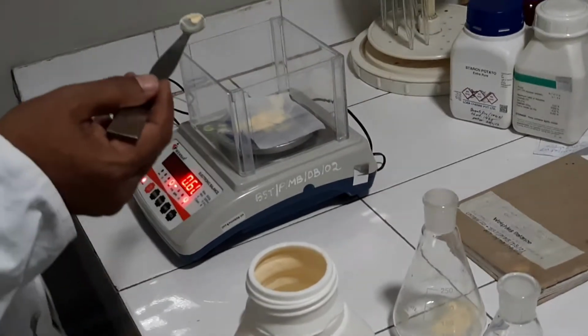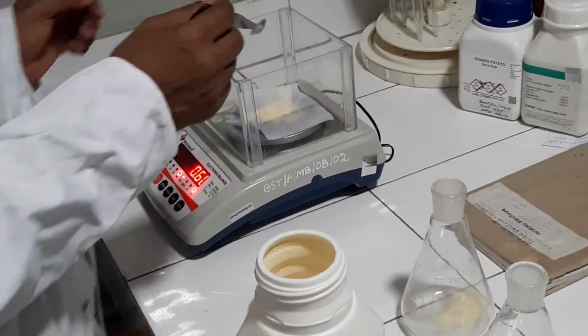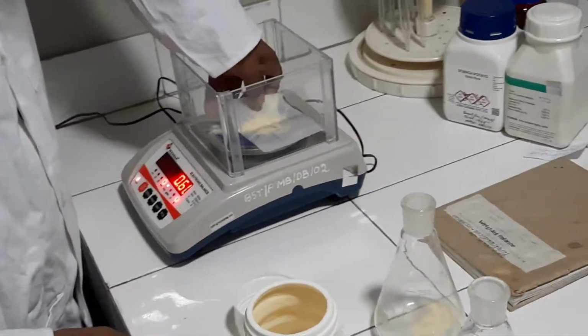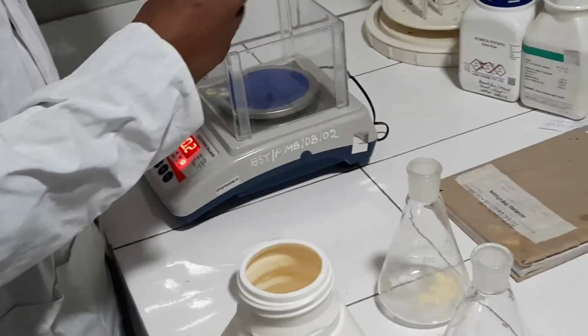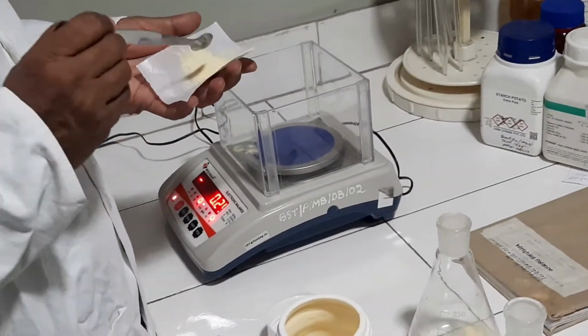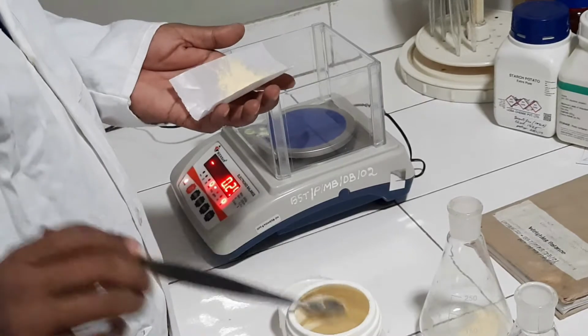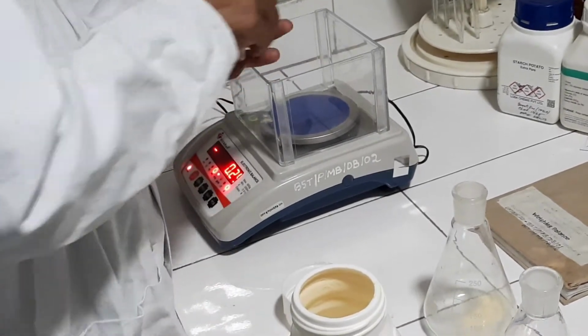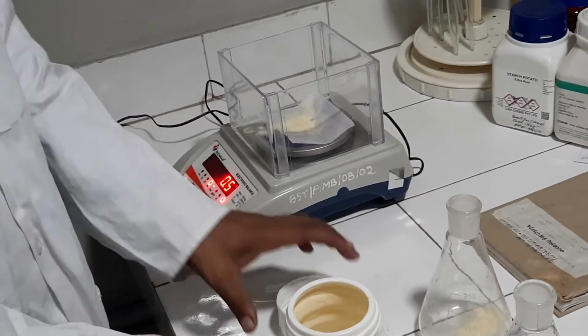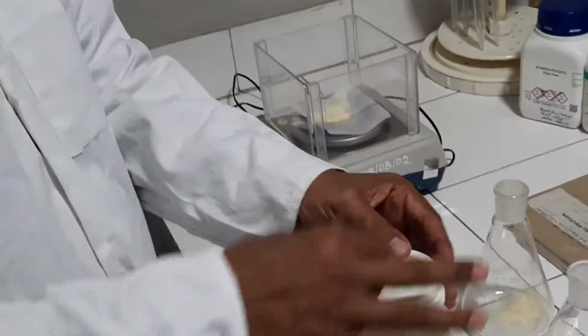Now it is about 600 milligram. We will have to take it out. Spillage should be avoided; minimum spillage should be there. Now it is almost 500 milligram.